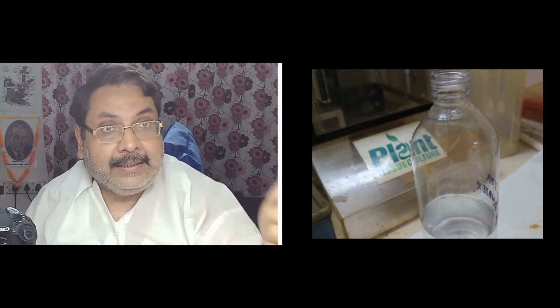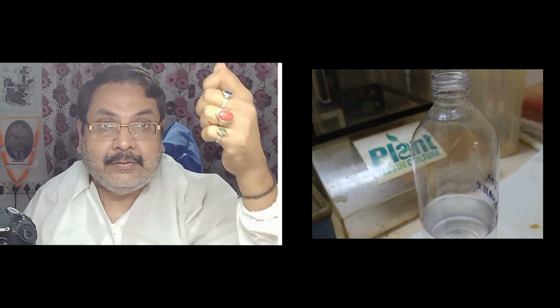Always release the air outside the media. Then put the plunger, then put the auto tip on the auto pipette, and just slowly release the button. The pipette will take up the liquid, whatever the fungal base or whatever the matter, whatever the volume you want, that you can release. Another pipette is there, which I have shown before.